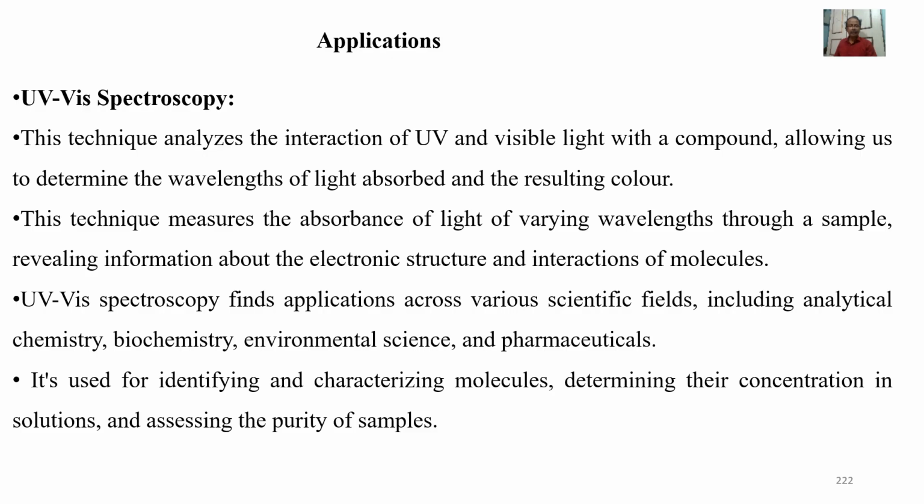UV spectroscopy is a versatile analytical tool used across diverse fields to identify, quantify, and characterize a wide range of substances and materials. For example, in pharmaceuticals, it helps to determine drug purity and concentration, while in environmental science, it monitors UV radiation levels. It is used to study chemical kinetics and analyze the purity of materials.